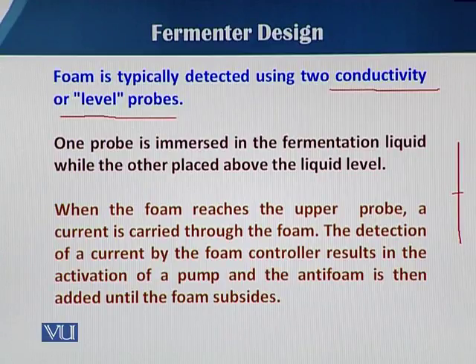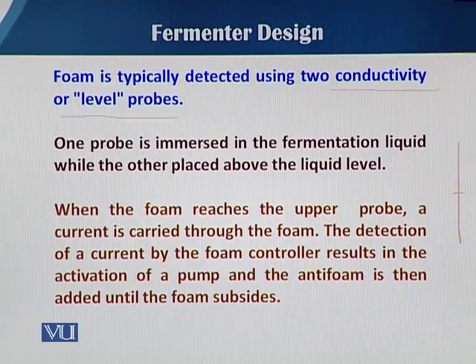So one is dipped and one remains just in the head space, to sense how much foam there is. When foam reaches the upper probe, a current is carried through the foam. So when the foam is produced and touches the upper level, that is sensed, and then there is a signal. By that signaling, the pump will turn on. That results in the addition of the anti-foam.